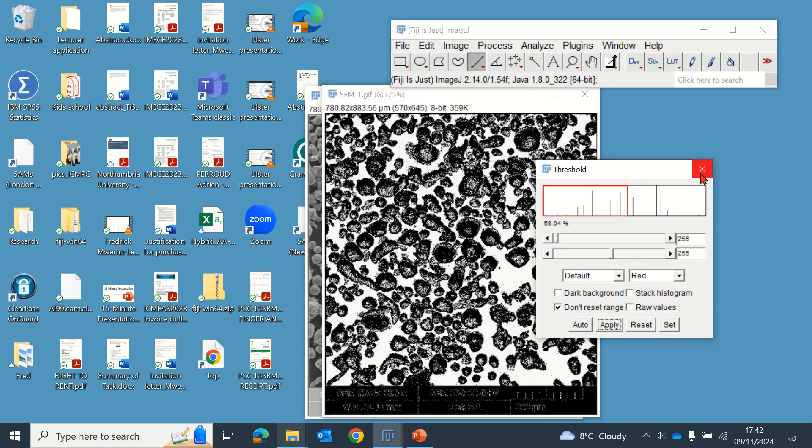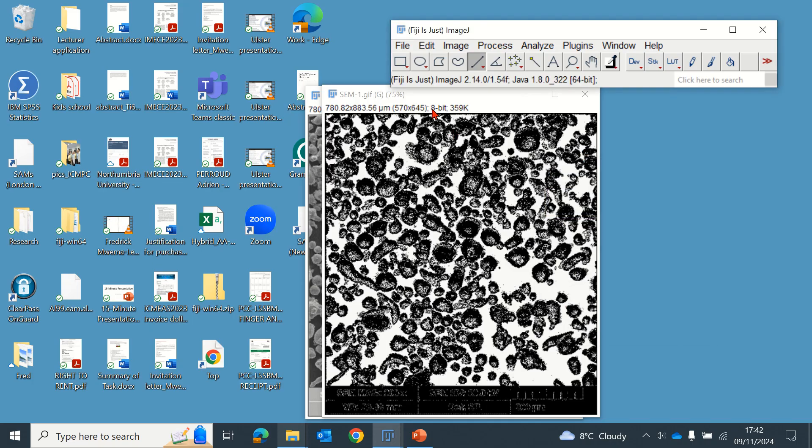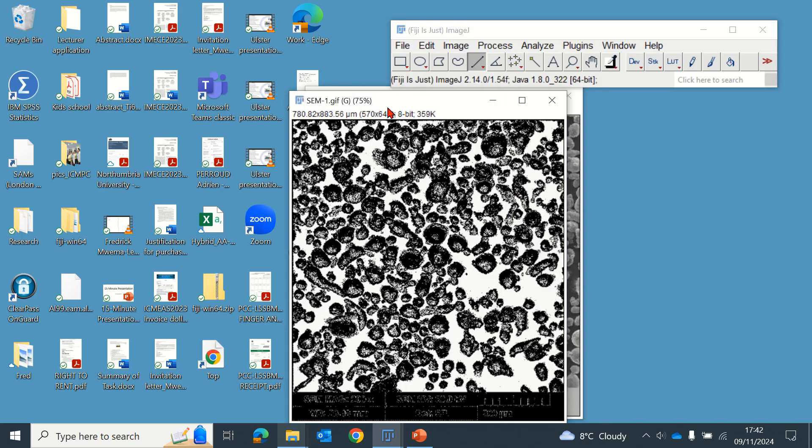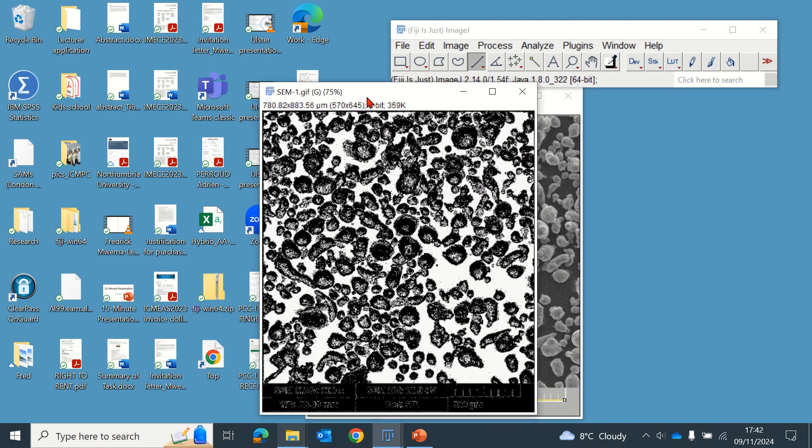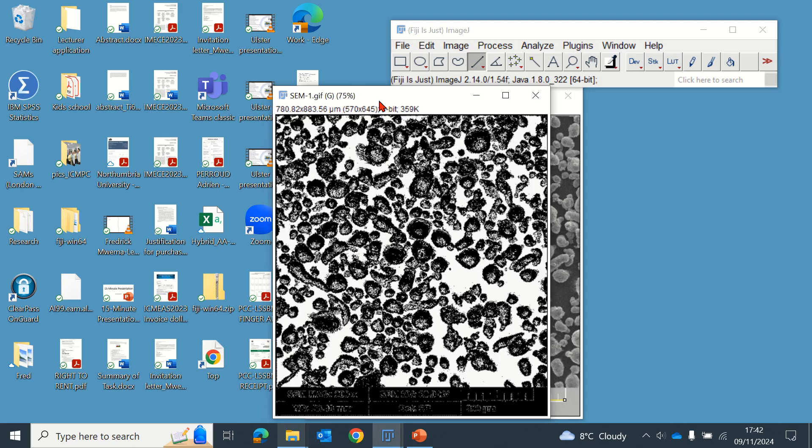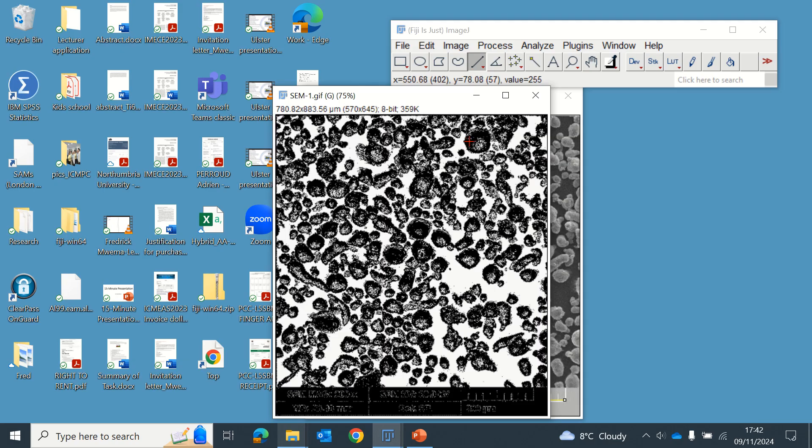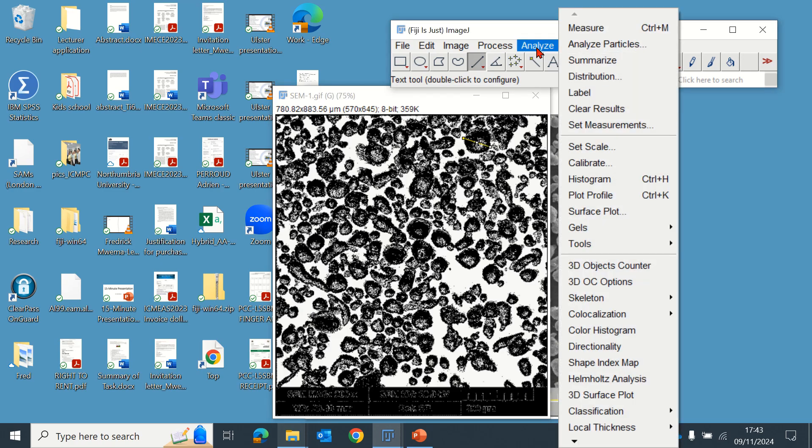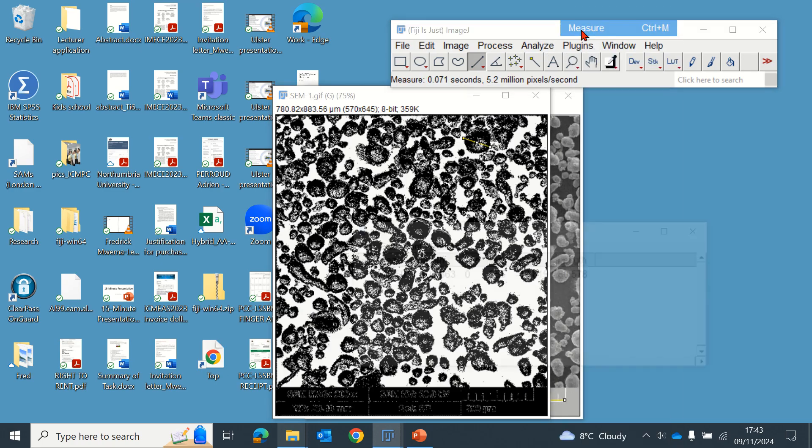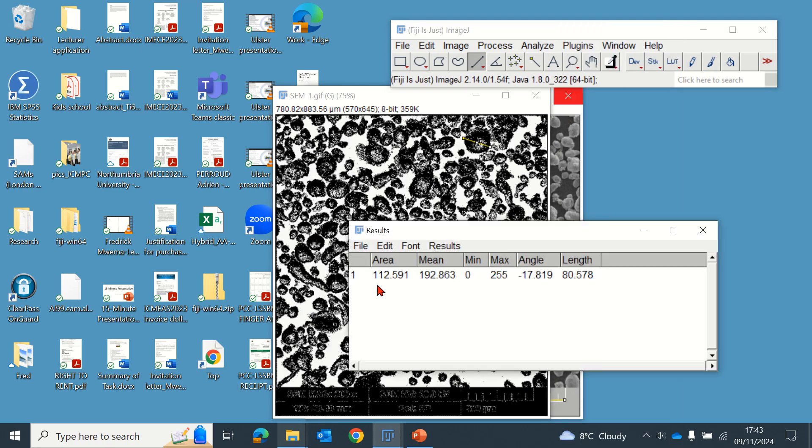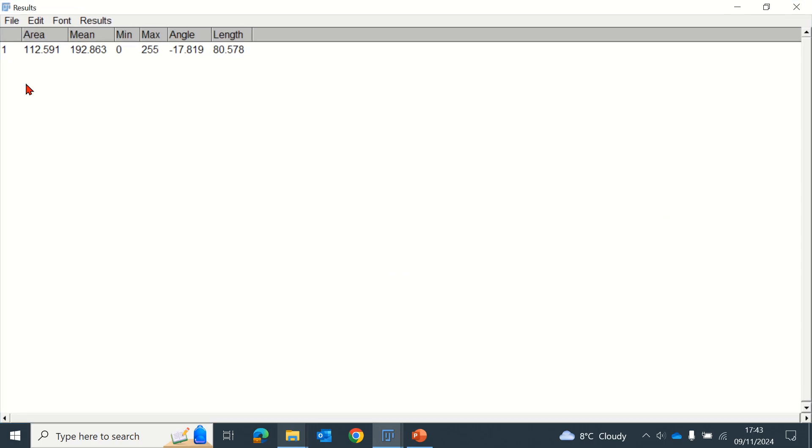We want to measure these particles. You can measure the specific particles you want by just drawing a line like that and measure. So that particle, as you can see, the area is given and the length.